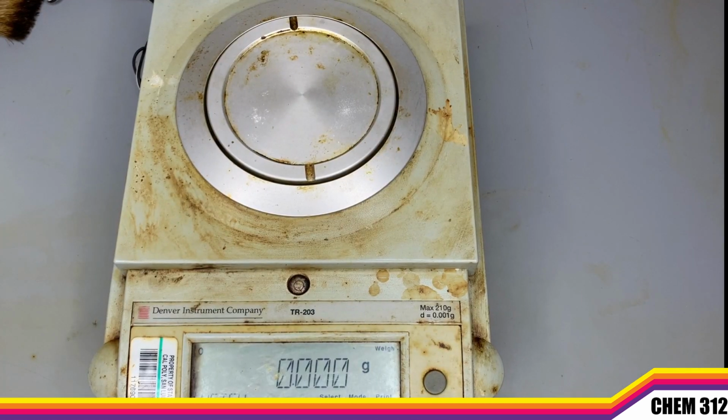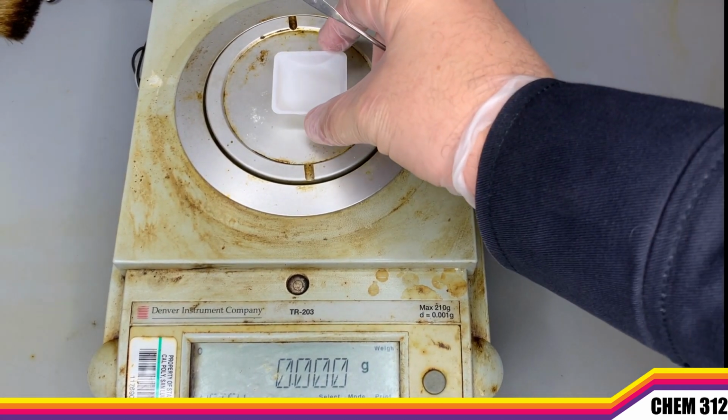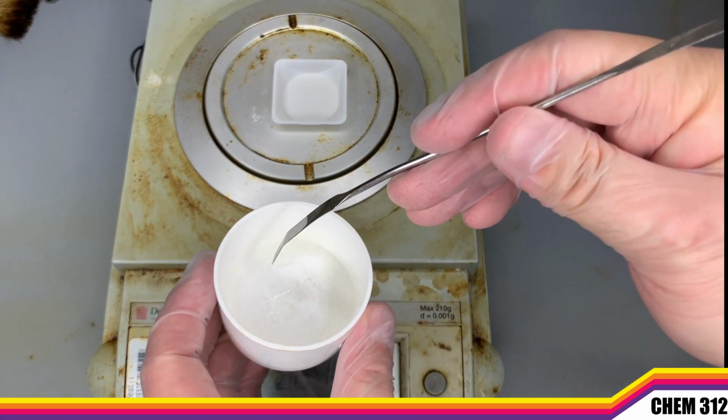So we're gonna get a mass and we're gonna weigh by difference here. That means that we first need to get a mass of just a weigh boat. So here we can get a mass of our weigh boat, and this is 641 milligrams, or 640 now that it's stabilized, for just our weigh boat. And let's see how much of this solid I can actually get out and we can measure to see what we've recollected.